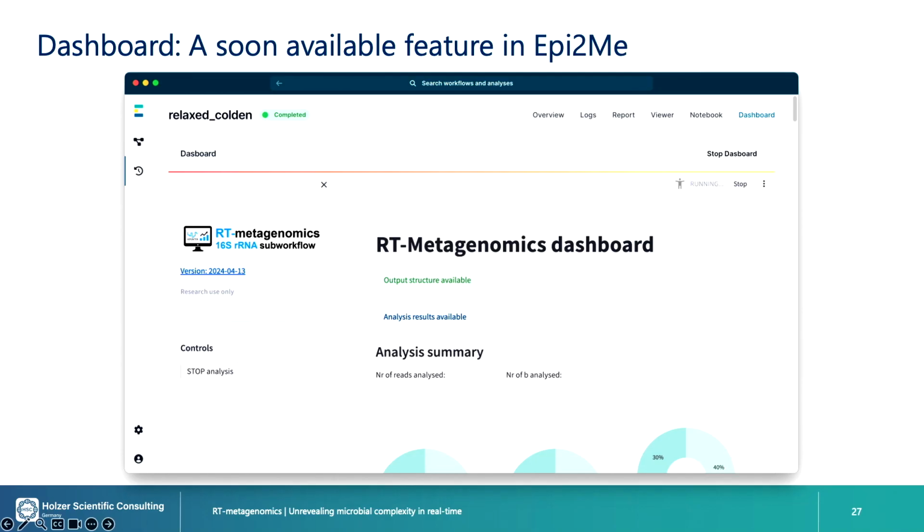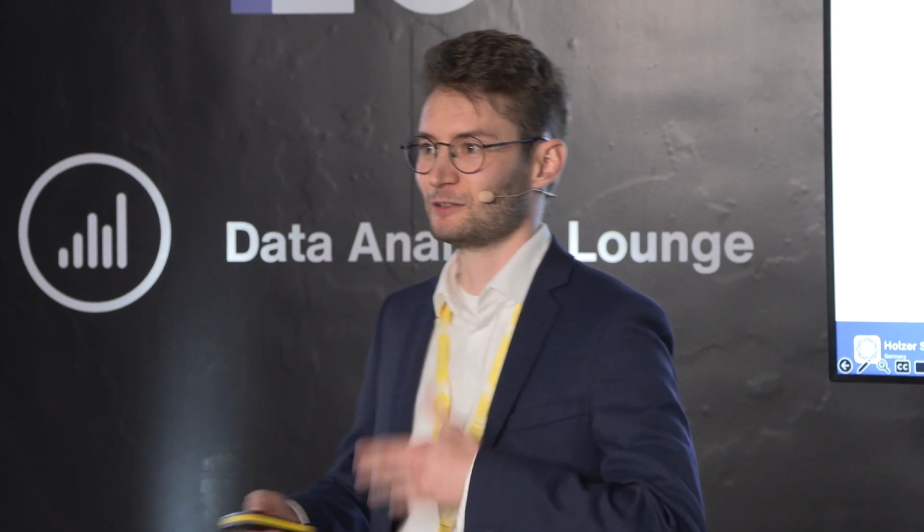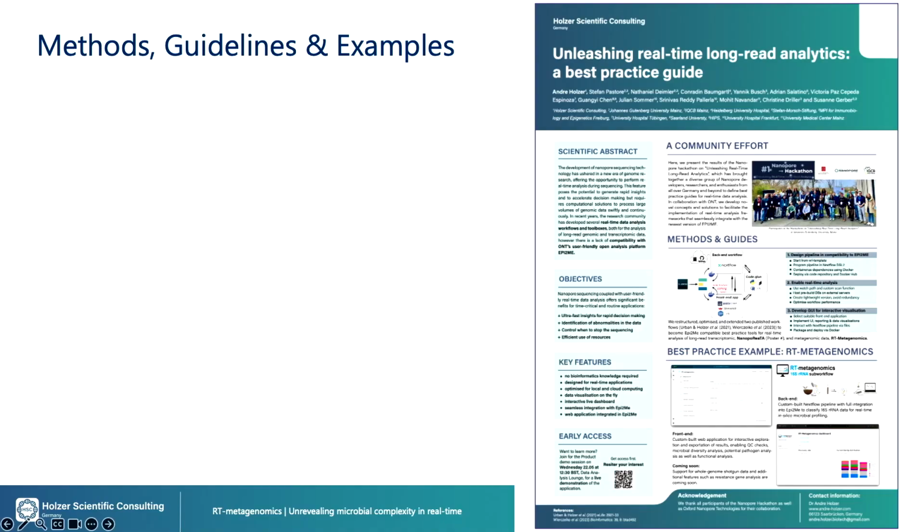Just to wrap this up, we're very fortunate for the collaboration with ONT, and as a result of that, this dashboard feature will be included in some of the new updates of the EPI2ME version, so there's no longer a separate window. You'll directly have this included. And if you want to learn more, if you want to use this new system for your own projects, please have a look at our poster where we've tried as a community to summarize the best practice ways to get there.